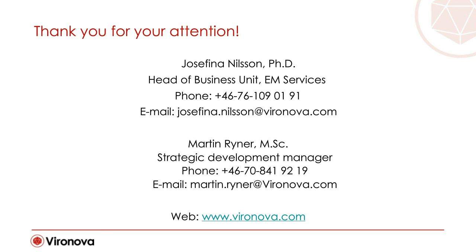Yes, we have validated some of our procedures for some of our clients and for their specific product. Not all of them, and that is up to the client to decide if they want us to do that or not, because they need to set the acceptance criteria. That is nothing that we can do.